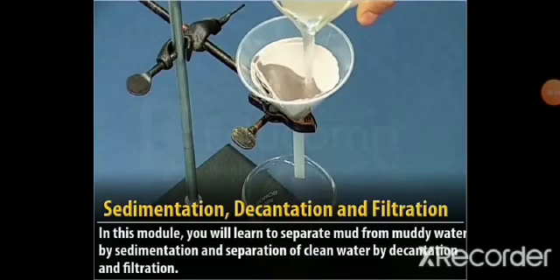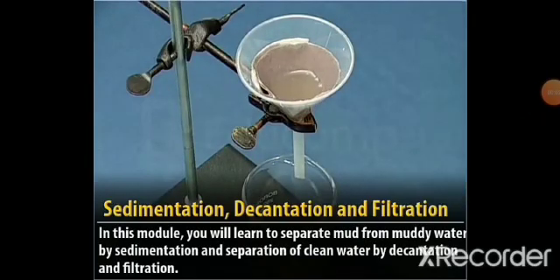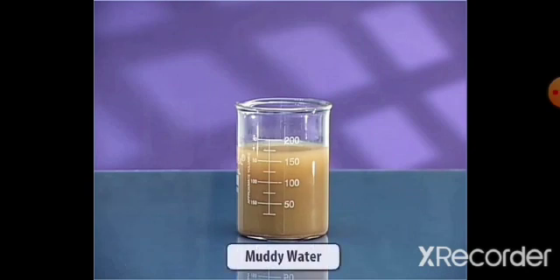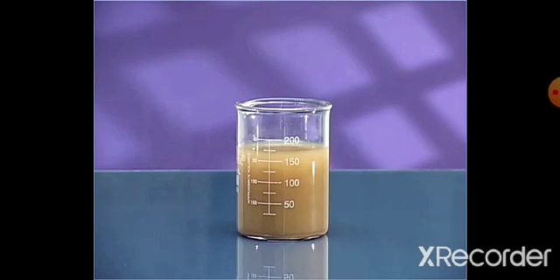In this module, you will learn to separate mud from muddy water by sedimentation and separation of clean water by decantation and filtration. How to get clean drinking water from this muddy water? Well, we shall use a few methods to separate the mud from this water-mud mixture.